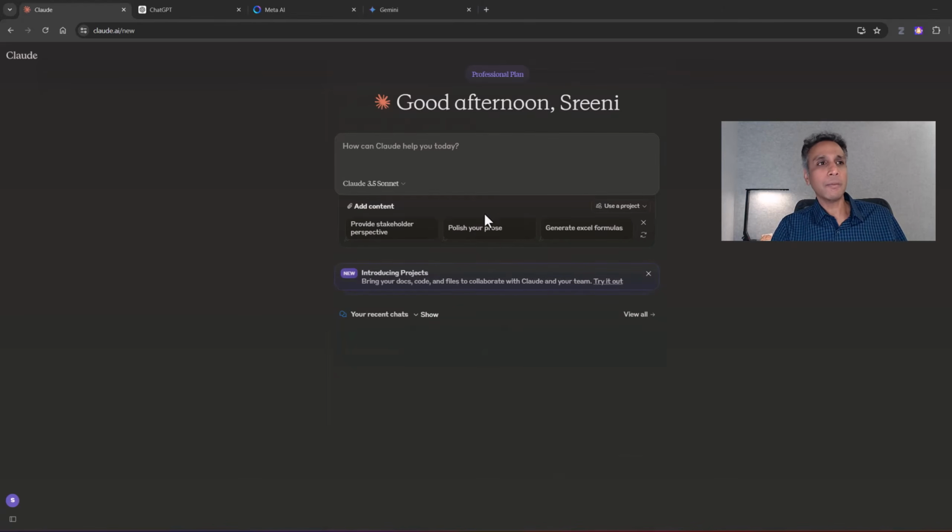So luckily, there is something called Stardist for nuclei segmentation. I'm pretty sure for other objects, you'll find off-the-shelf models that usually work very well. I know Stardist works very well. So instead of the threshold segmentation, can we tell chat engines that, hey, I know a model that already works very well for segmentation, so go ahead and use that. The more information you give the chat engine, the better the quality of code it's going to give you.